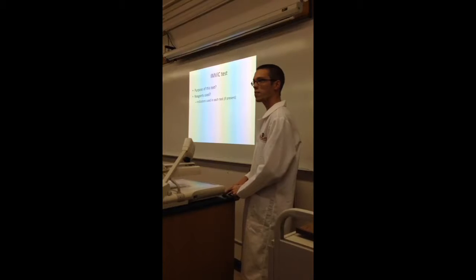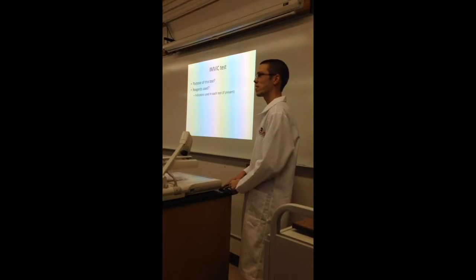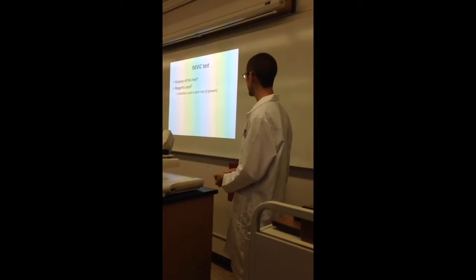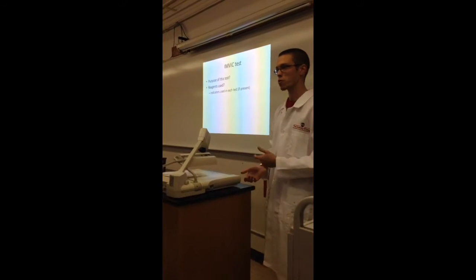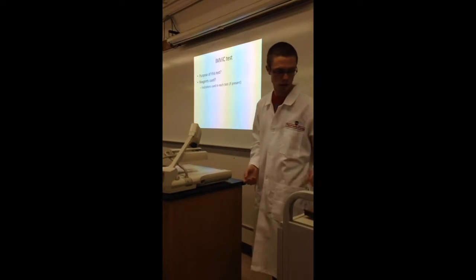Okay, E. coli. Enterobacter, something? Which Enterobacter? Aerogenes? Aerogenes, okay, good. And so the reagents used, I'll have a chart for this. I'm not going to ask everyone to say them right now. But since there are a lot of tests, there are a lot of indicators, a lot of media to remember, so it's useful to put this in a chart.